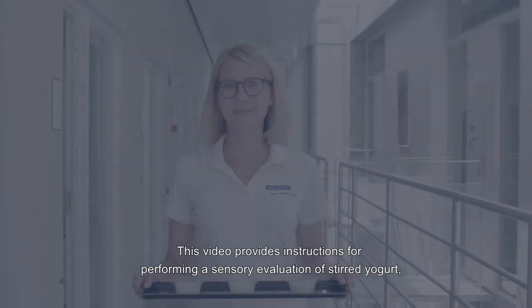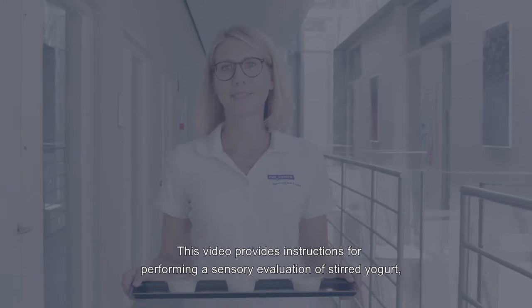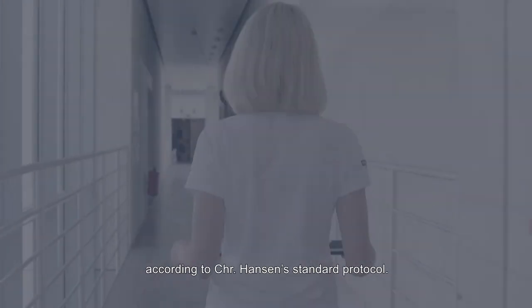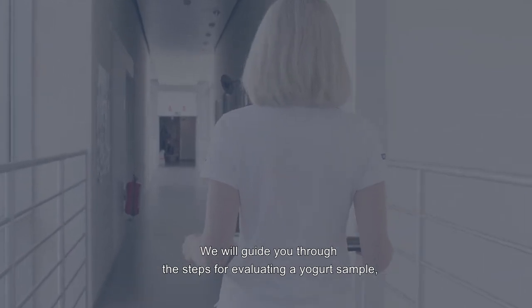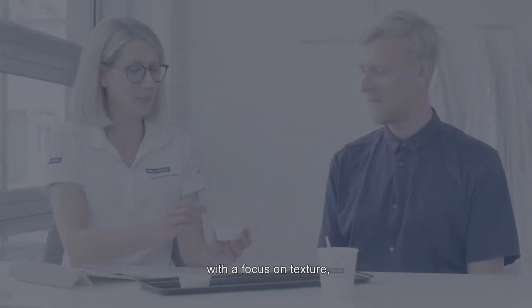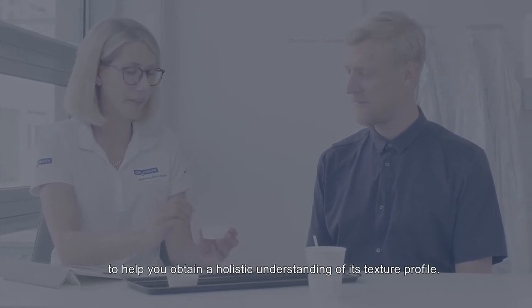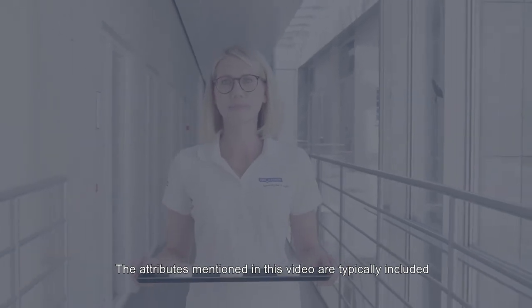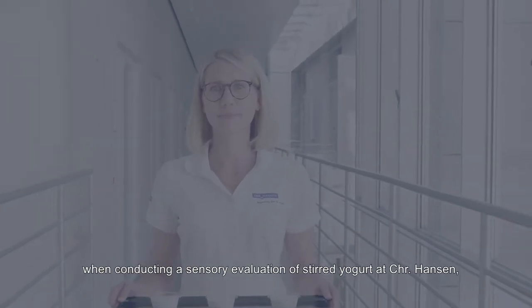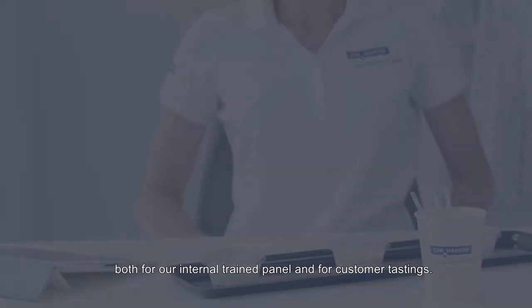This video provides instructions for performing a sensory evaluation of stirred yogurt according to Christian Hansen's standard protocol. We will guide you through the steps for evaluating a yogurt sample with a focus on texture to help you obtain a holistic understanding of its texture profile. The attributes mentioned in this video are typically included when conducting a sensory evaluation of stirred yogurt at Christian Hansen, both for our internal trained panel and for customer tastings.